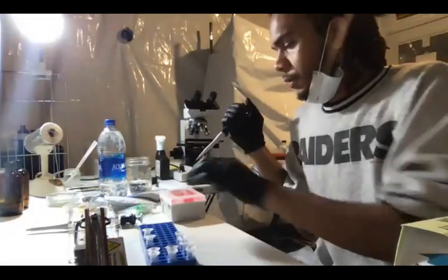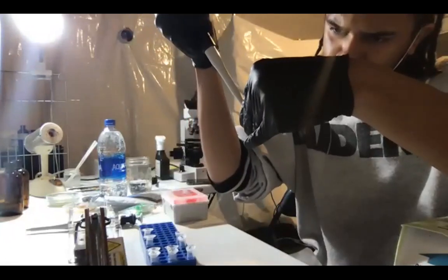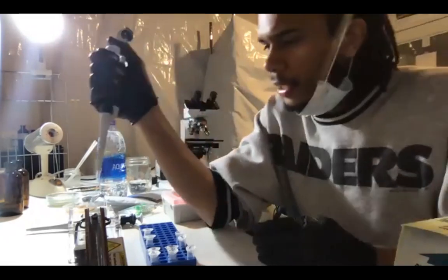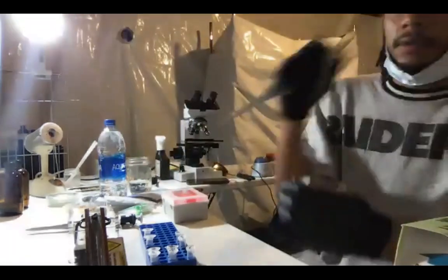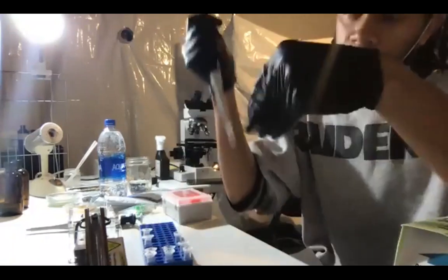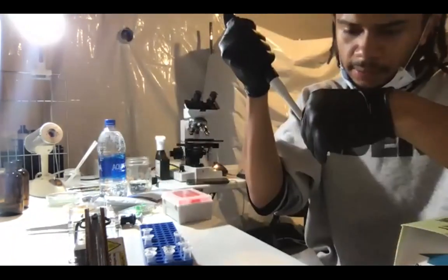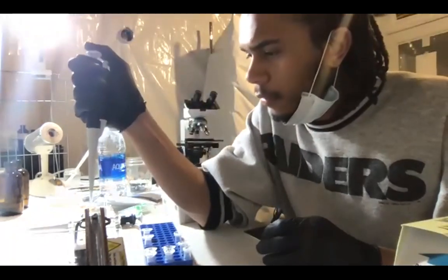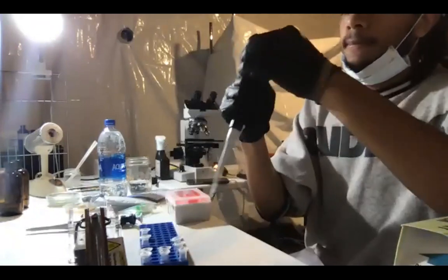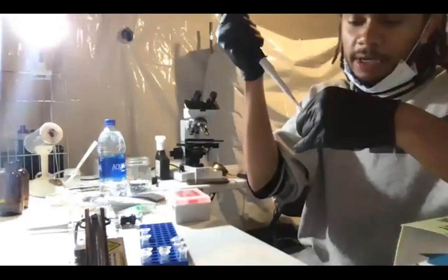Change your pipette tip. Take your number 2 sample. Put it in number 2. And then again in number 6. New pipette tip. Number 3 sample. Number 3, again, number 7. And then number 4 goes to number 4 and number 8.